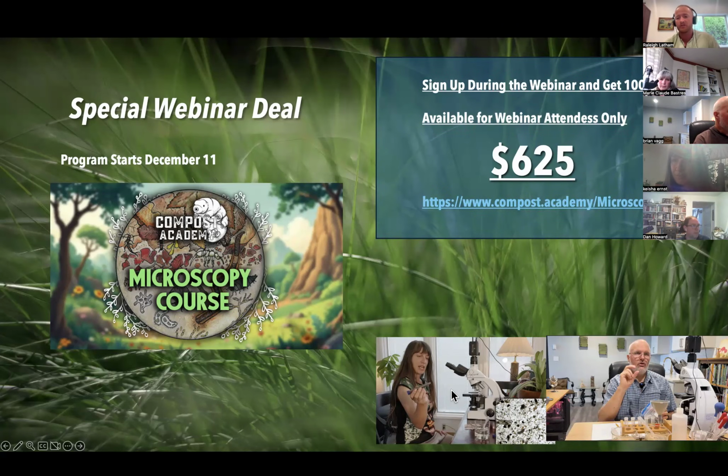If you've been wanting to dive into microscopy, there's no better time than this. I really wish I would have had this when I was learning microscopy, because I had to go all the way to a lab and pay thousands of dollars of my own money to do this lab work. Having this training with someone like Keisha and Brian is awesome. There's no comparison.